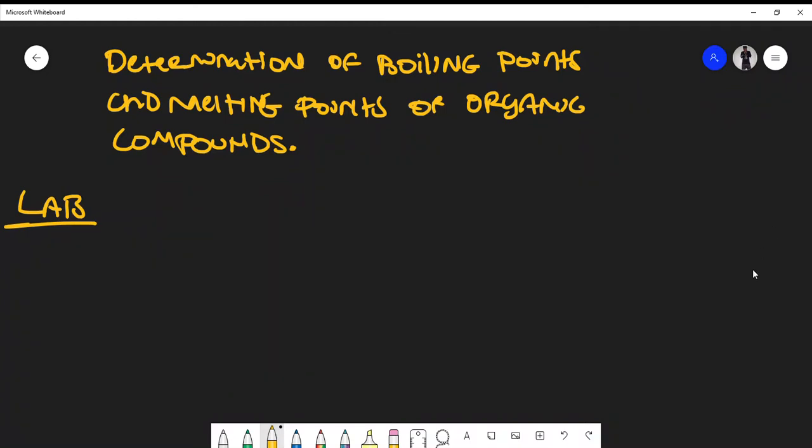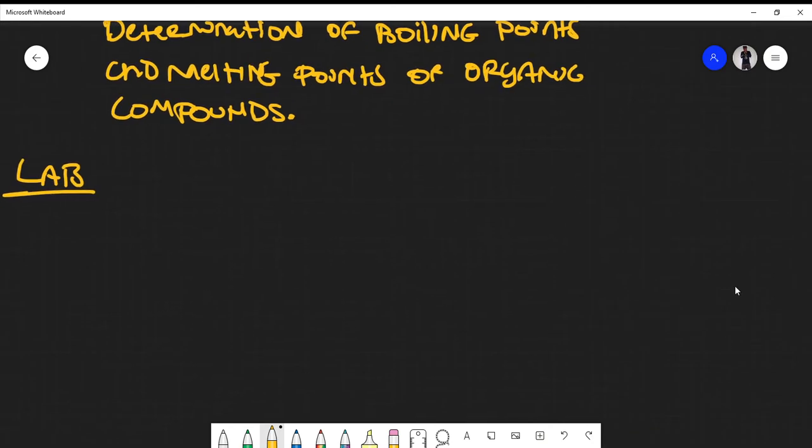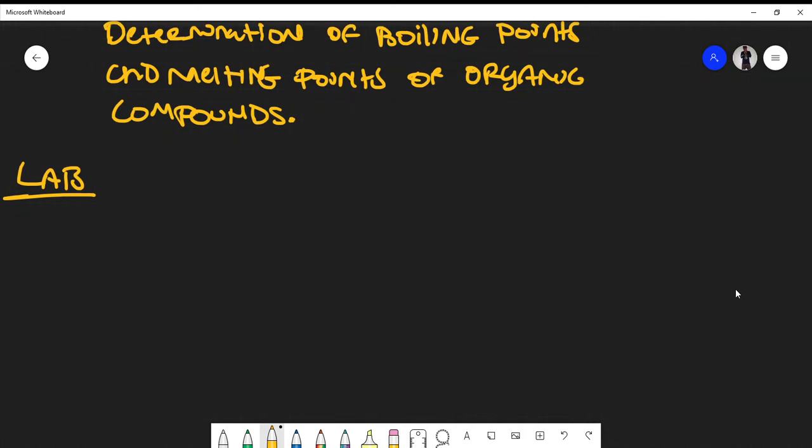So in this video, we're going to talk about the determination of boiling points and melting points of organic compounds. This is one of the first labs that you will actually do in organic chemistry, specifically for organic chemistry 1. And typically at undergraduate level, you should expect some compounds like these to be present.